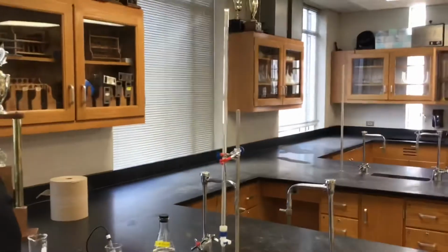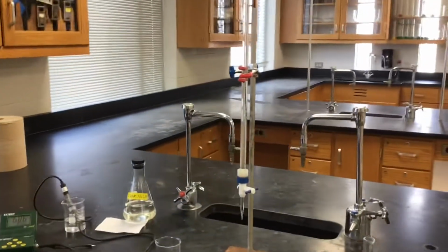Today is titration curves. Oh yeah, you're gonna love this. It's too bad you're not here to titrate in person because it's a lot of titrating. So titration is all about the process of using a burette to help you with your calculations.